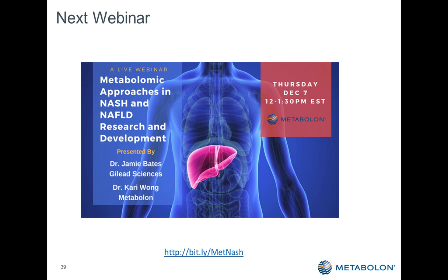Okay. We've had a few questions submitted whilst you've been answering those ones, Luke. I'll start by asking: how successful are the current metabolomics approaches in identifying toxicology aspects? So we're somewhat successful in that space. We like to say that we can use metabolomics, particularly the untargeted approach, for pseudo-toxicology approaches. Because we're able to measure pathways, we are able to see changes within those pathways, particularly liver tox and the changes in the bile acids, and kidney tox. We are able to assist in toxicology approaches.